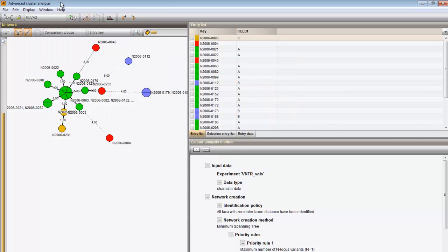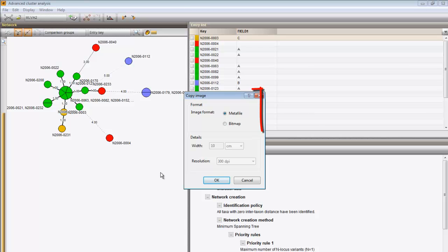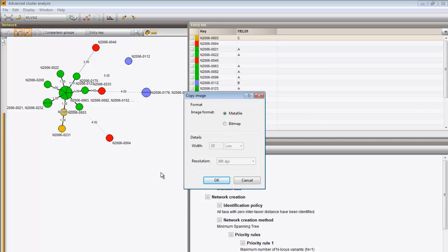The image can be copied to the clipboard as meta file or bitmap and pasted in another application.